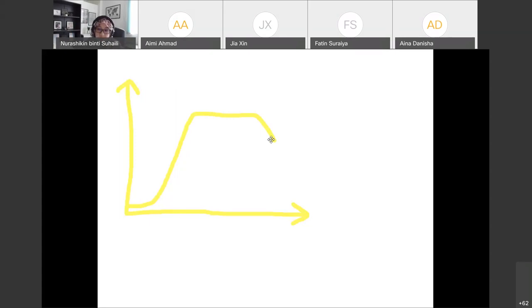But what differs between bacteria, yeast, fungi and the others is the time. This axis is time, and you can plot it depending on the type of organism. For animal and plant cells, normally we use days, and for microorganisms, normally we use hours, because it just happens in hours. So the unit depends on the organism. For bacteria, the doubling time depends on the type, but normally it's about 1 to 2 hours.